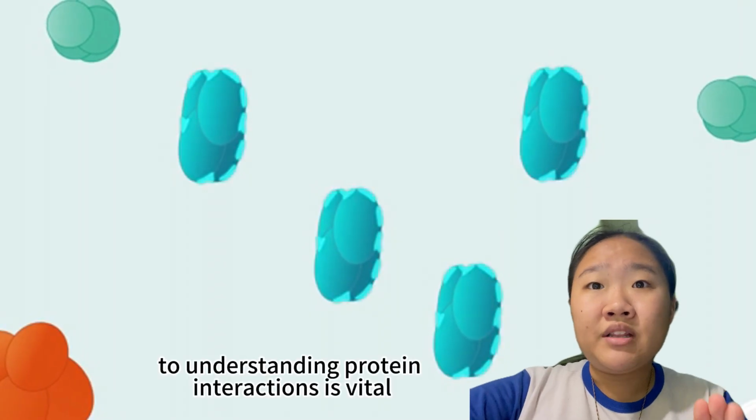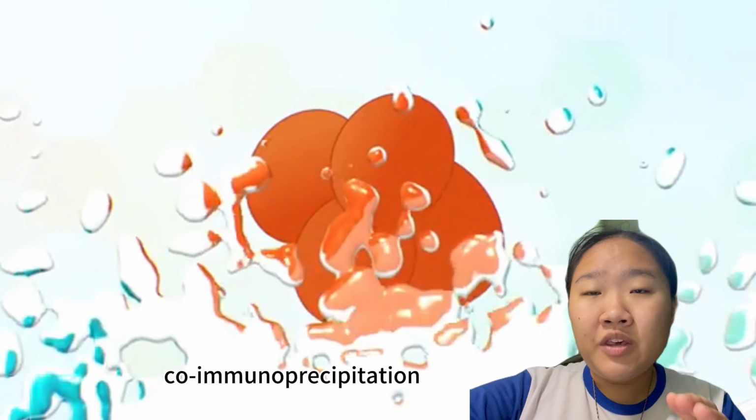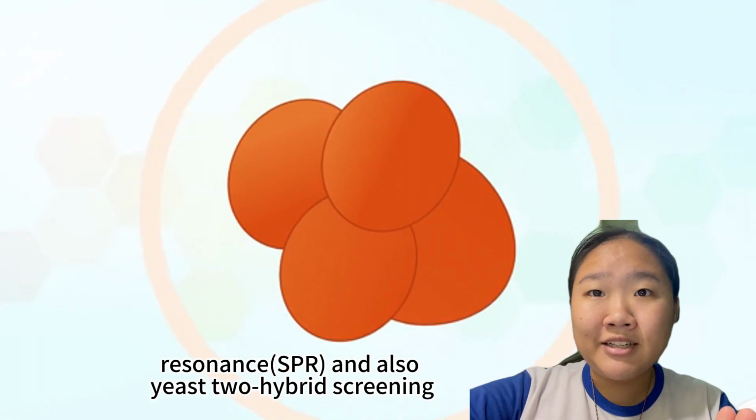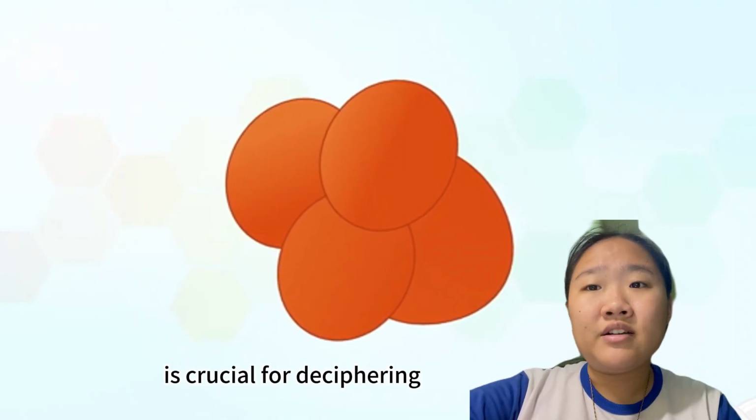Understanding protein interactions is vital in biology. Thus, purified protein, which is used in co-immunoprecipitation, surface plasmon resonance (SPR), and also yeast two-hybrid screening, reveals how proteins interact, which is crucial for deciphering cellular pathways.